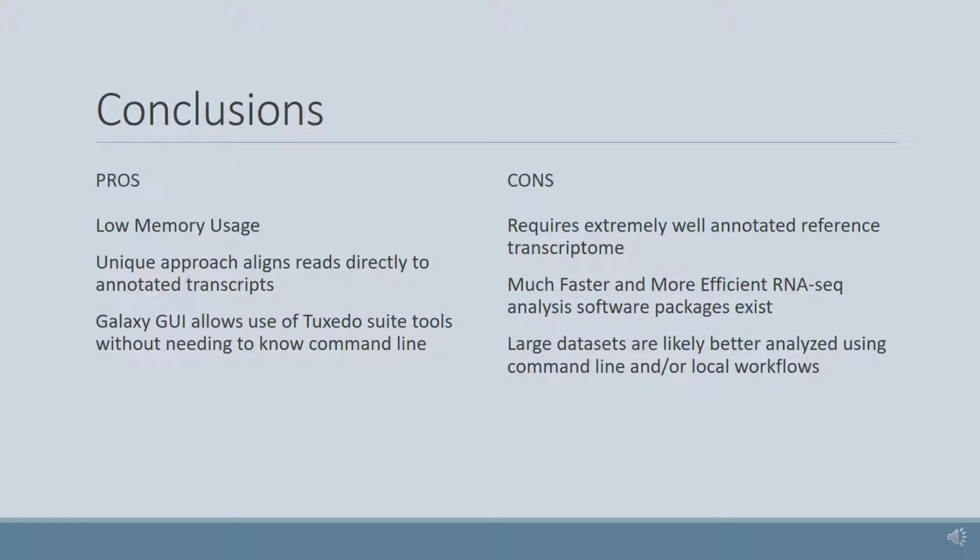Another thing with Galaxy, the larger the data set you have, the longer it's going to take, and especially using that public instance, you're probably better off installing your own local instance or learning how to run command line tools. But overall, the Tuxedo Suite is a really good package. It provides all the insights that you need. All the documentation out there on the internet makes it very easy to use and to troubleshoot if you were ever to run your own RNA-seq analysis.